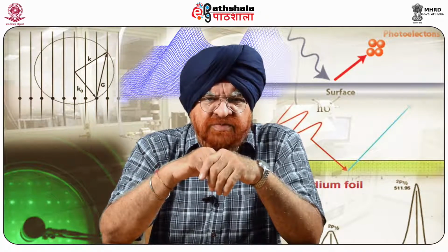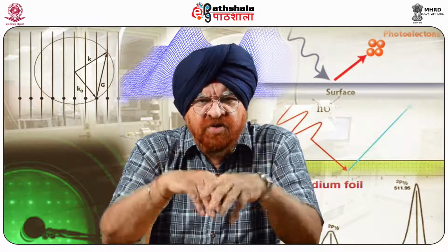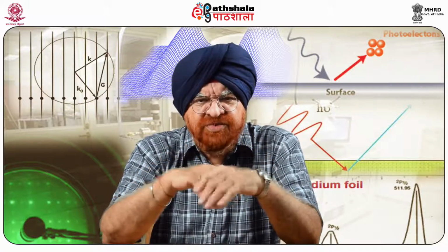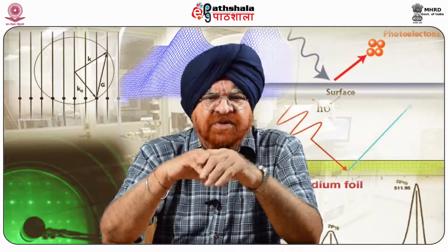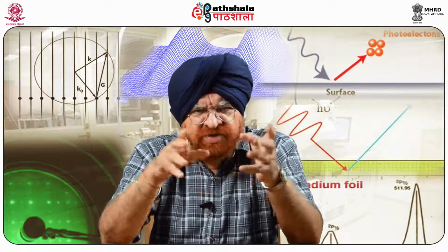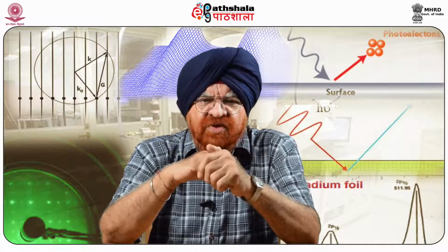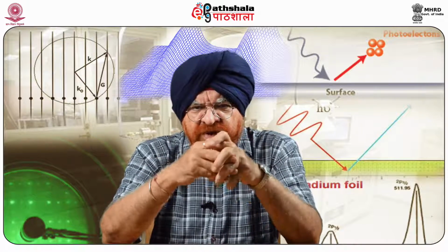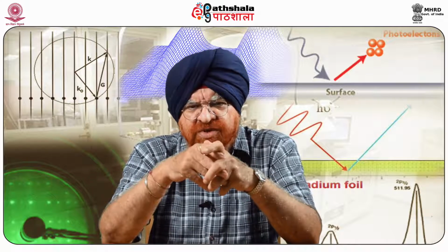The ECSTM can only scan conductive surfaces, as I said earlier, or thin non-conducting films and small objects deposited on conductive substrates. It does not work with non-conductive materials, which is very clear. It has been repeatedly said earlier also, and this is one of the major limitations of this equipment. Non-conductive materials, obviously, are glass, rock, etc.